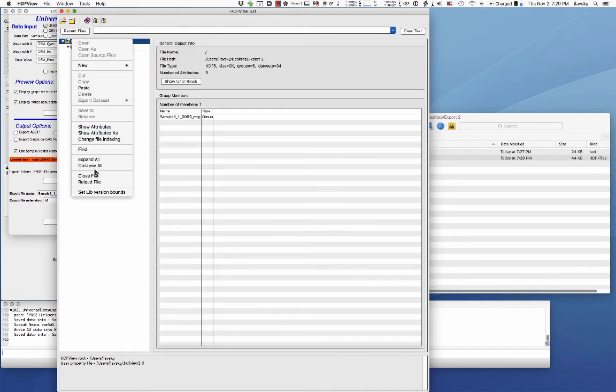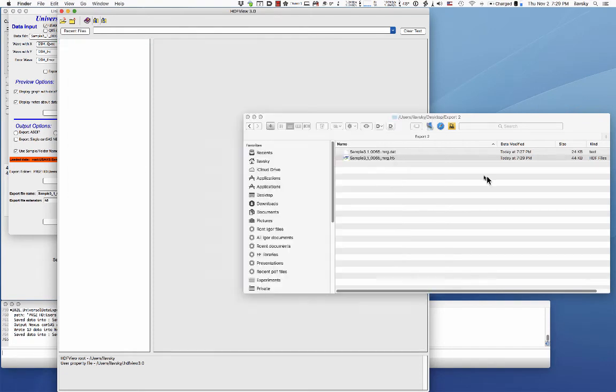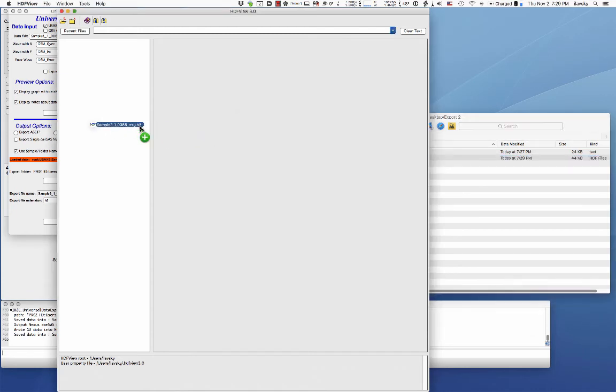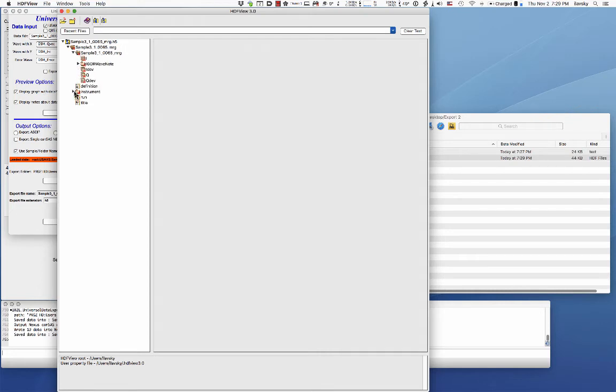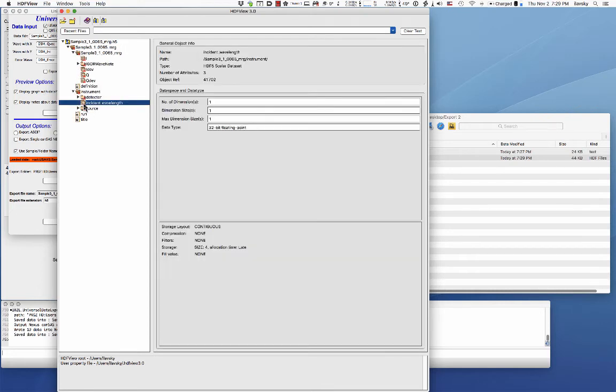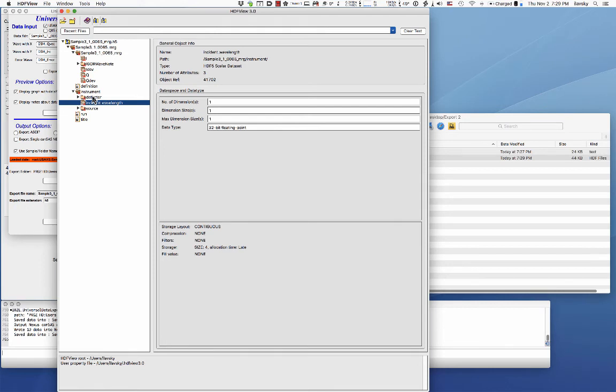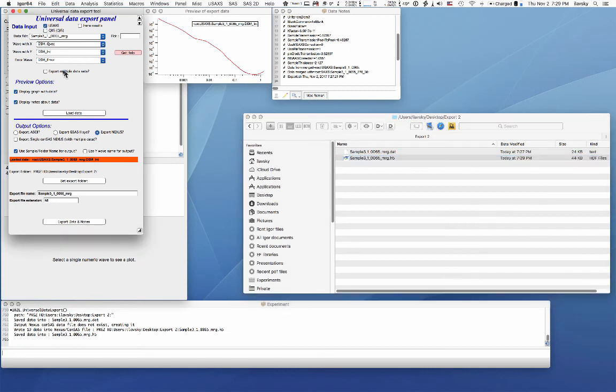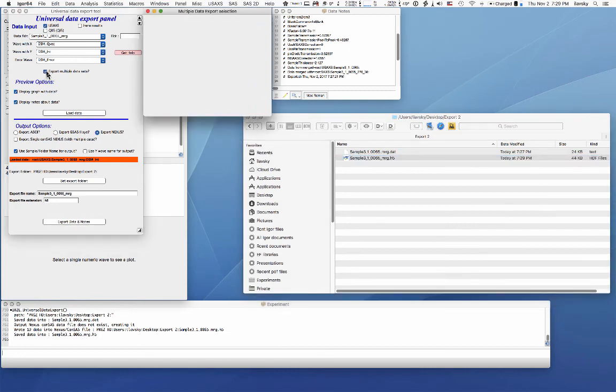It will write a file with extension H5. Let me just close this one here. It's the old one. And then I'm going to get this one. So this is a new file. We created that. Inside the file is a hierarchical structure of data. There's lots and lots of metadata. So you can figure out what's all in there. And this is much easier to read for software than the ASCII file, because the software can much easier understand this.